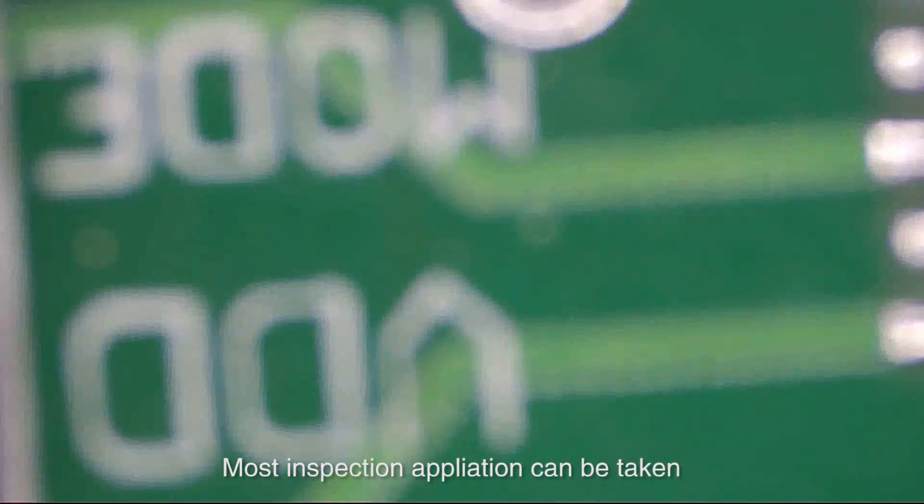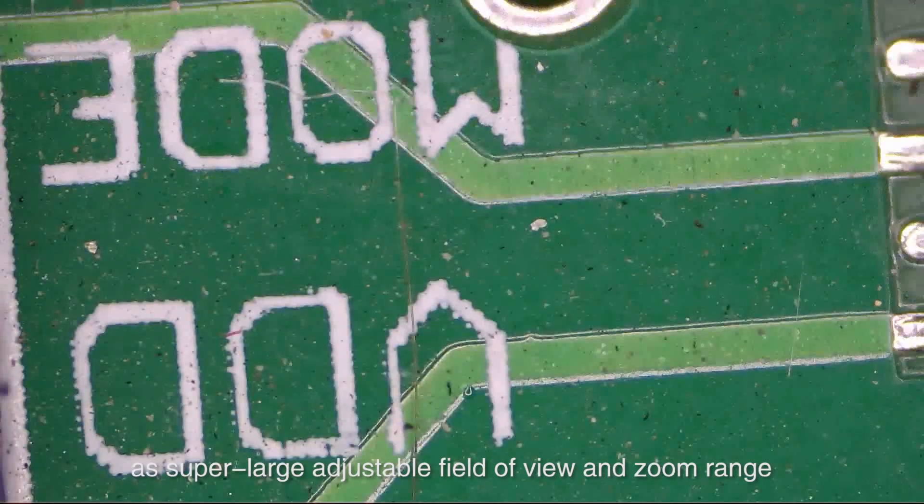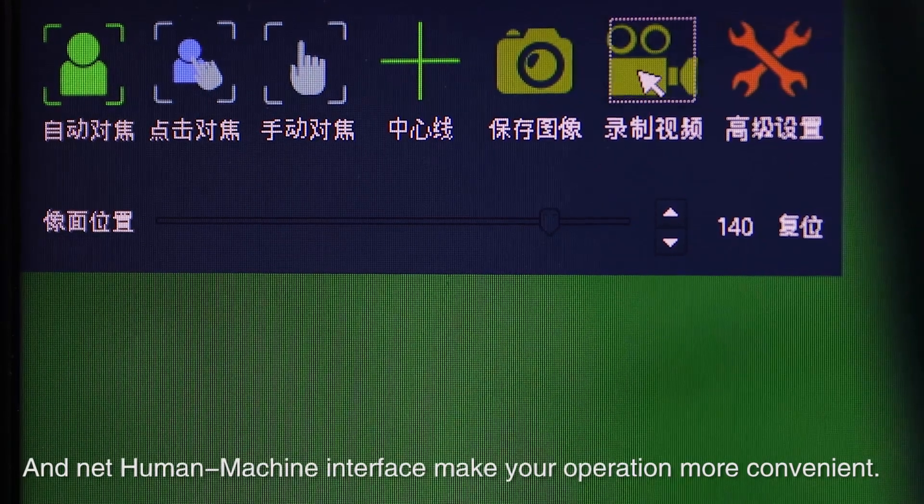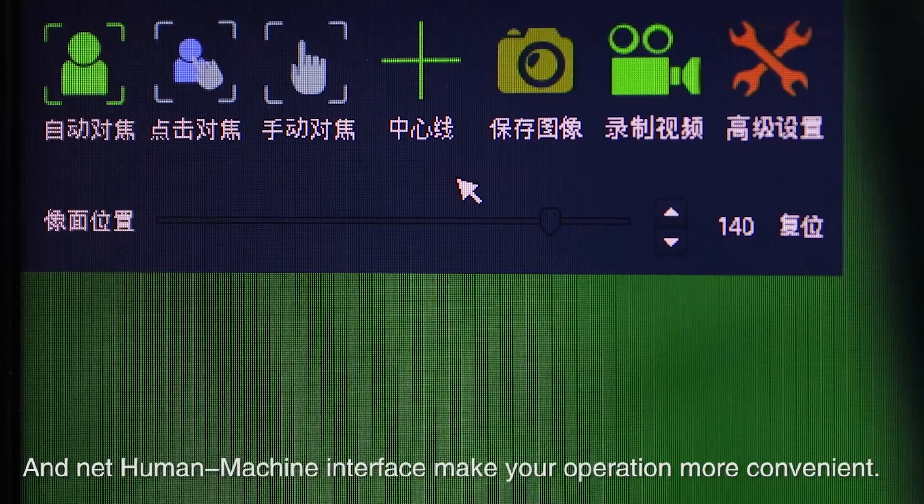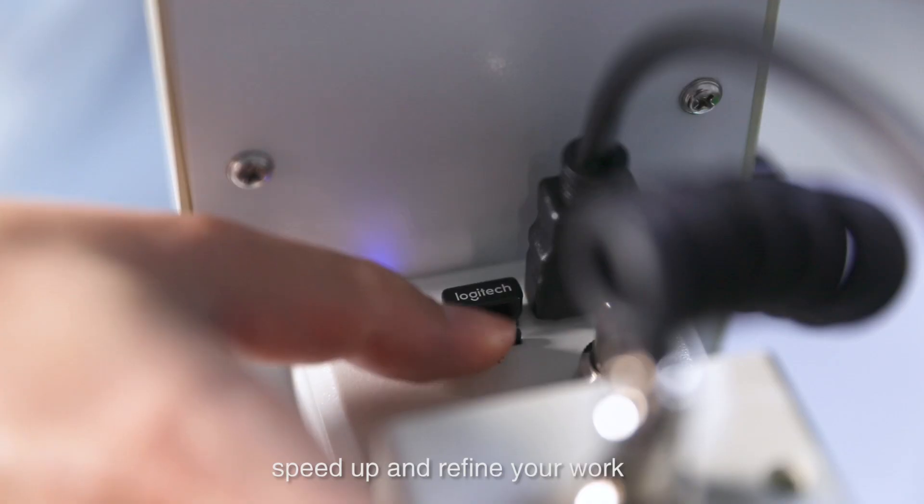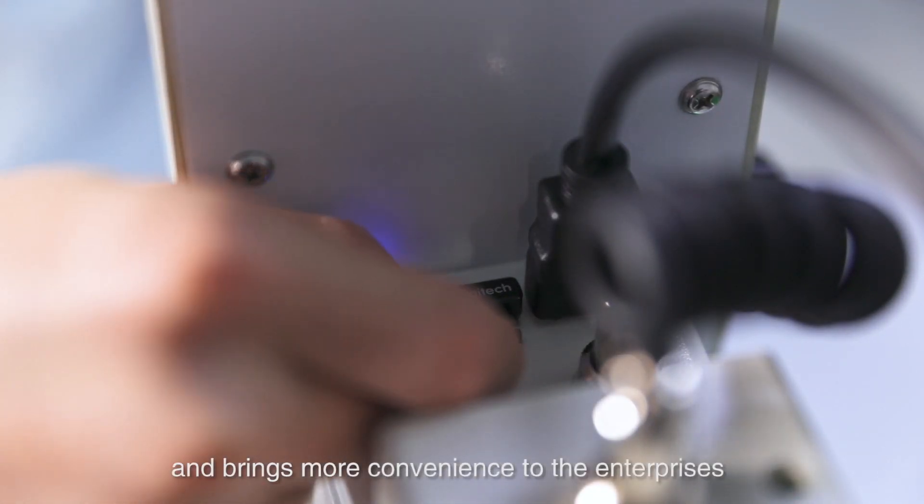Most inspection applications can be taken at super-large adjustable field of view and zoom range, and the human machine interface makes your operation more convenient. Pomius Autofocus Video Microscope indeed speeds up and redefines your work and brings more convenience to the enterprises.